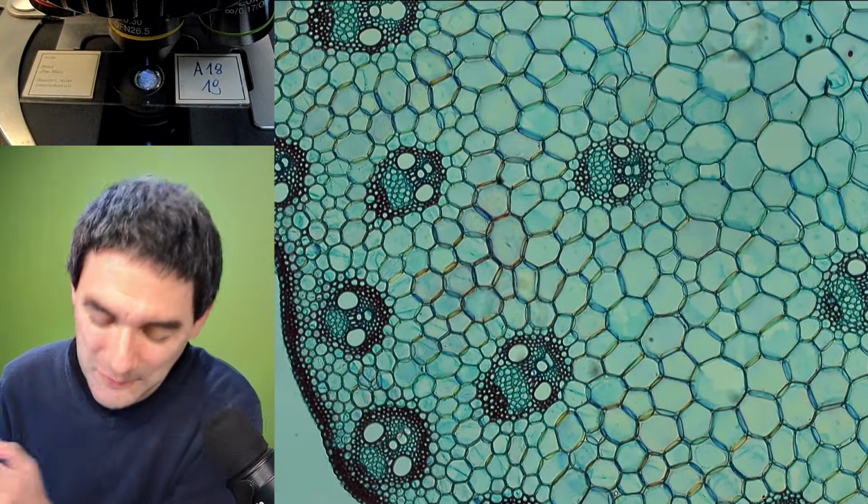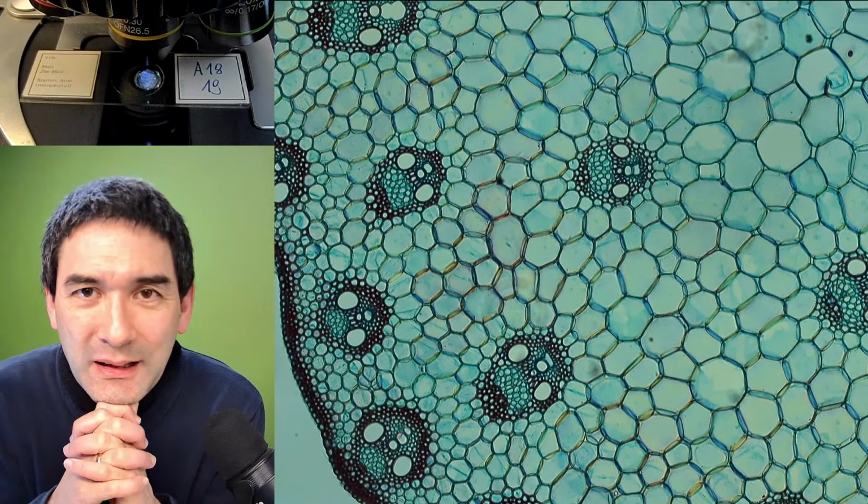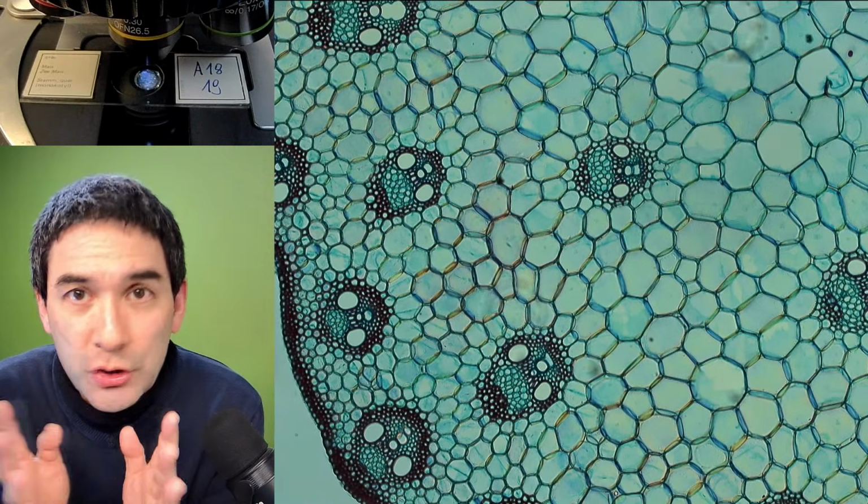I'll give you a look. I'm a teacher, and students like to ask questions. And very often there are questions: why are they arranged like that? What's the purpose, or what's the meaning? Why does it look like that? And there's got to be a reason behind it.